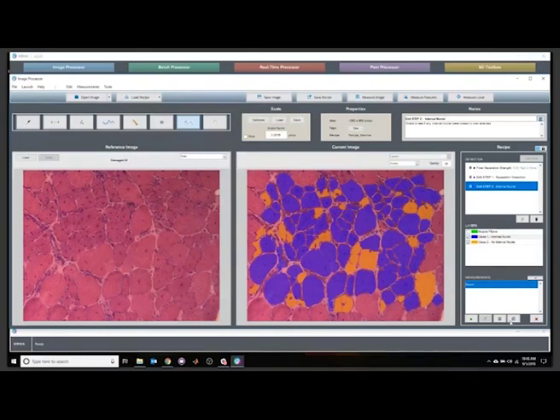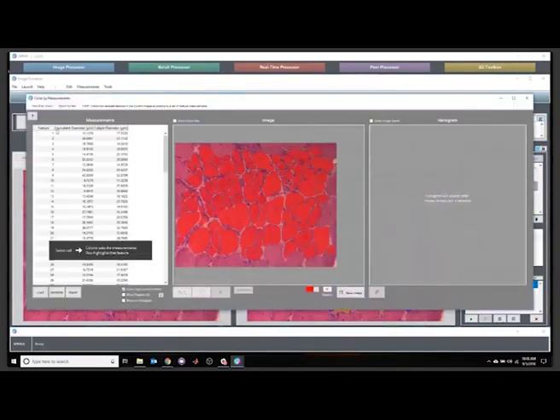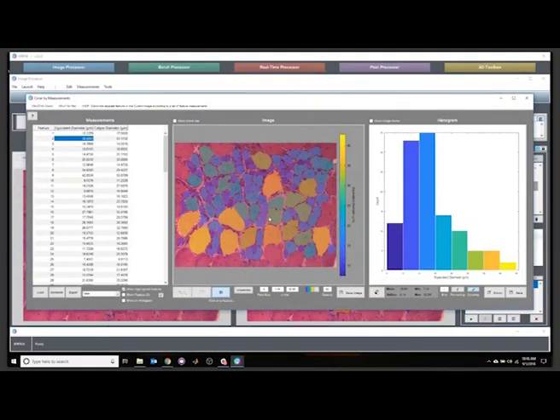Again, same thing, regenerate measurement. You can copy this directly from MIPAR. You can then go ahead and generate your diameters. You can view them, or you can save them directly to a file if you don't need to visualize these like that. And these create very nice reports and representative figures for publication and presentations during your lab meetings to give your team a very good idea of what you're working with.